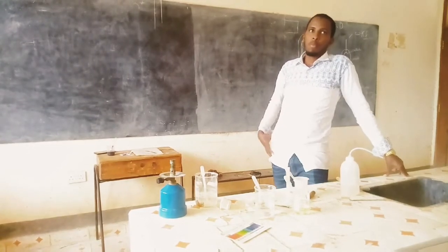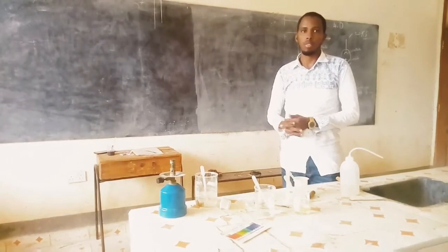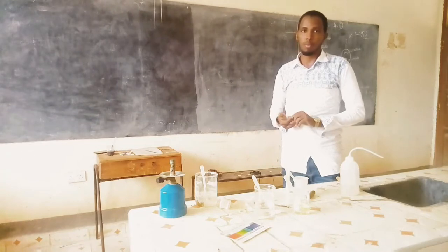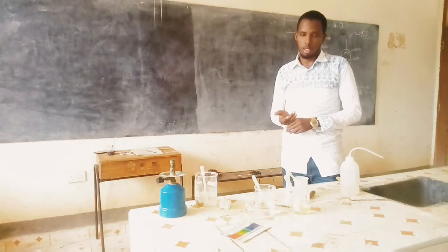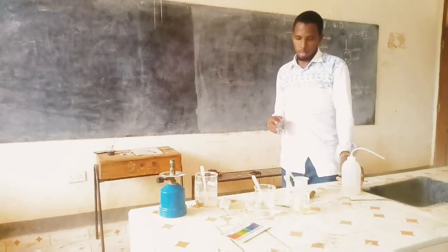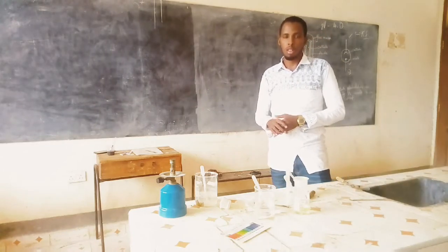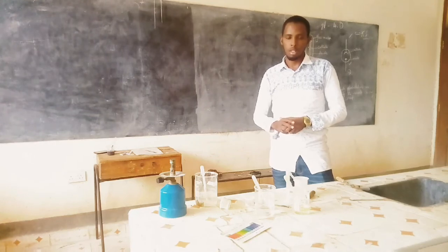That is a test for cations and anions. You are analyzing solid H. Now the conclusion is that solid H contains either magnesium or aluminium, and the anion that we have confirmed was sulfate. So the anion in solid H was sulfate, but the cation is either aluminium or magnesium. Now the test the student did, we call it analysis of cations and anions.